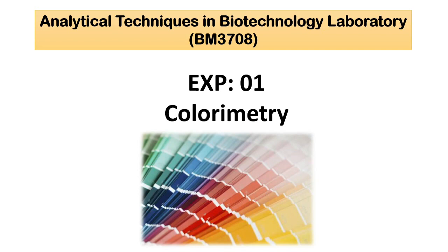Refractometry, did I tell you? We will be doing refractometry also, for different samples, and how the refractometer helps us in analyzing various food samples and other biological samples.